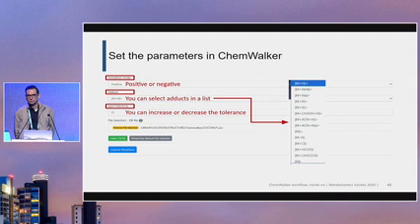The other thing that's going to change a little bit is when you perform the whole analysis of the features and keep track of, for example, the carryover effect. It depends on the amount of carryover you have in your samples, the blanks, and the pooled QCs, and then you can set the threshold.